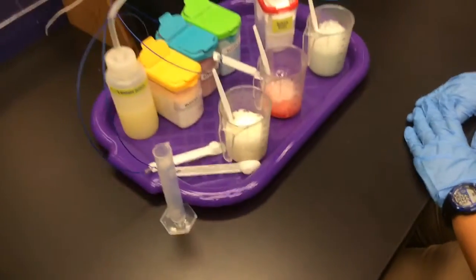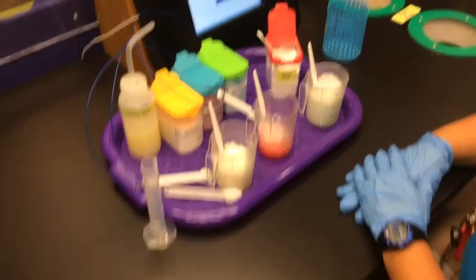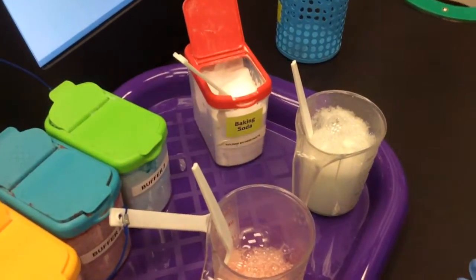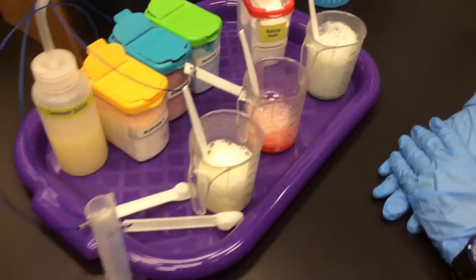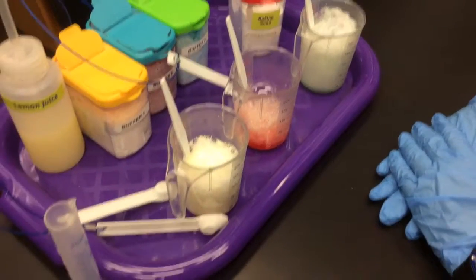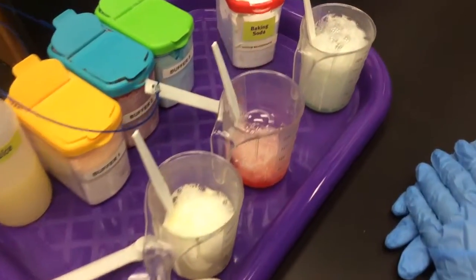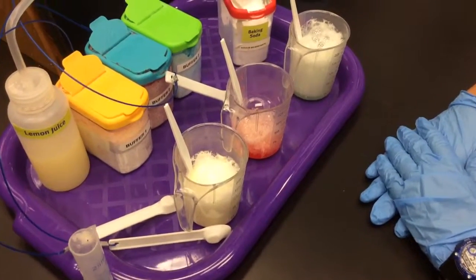All right, and so basically we've done the full experiment, and the last one is actually forming more bubbles. So it's getting pretty high. Okay. Good. So right now we can just look and guess which one we think is producing the most bubbles for the longest period of time.